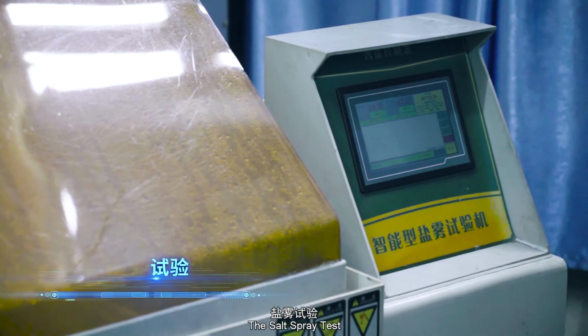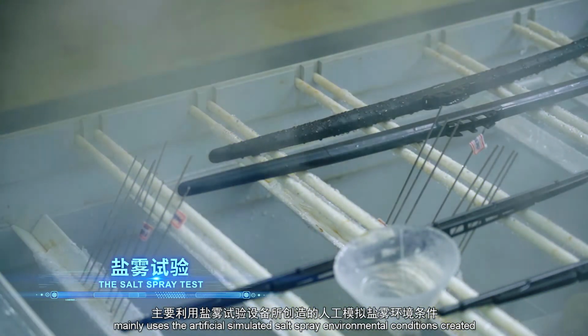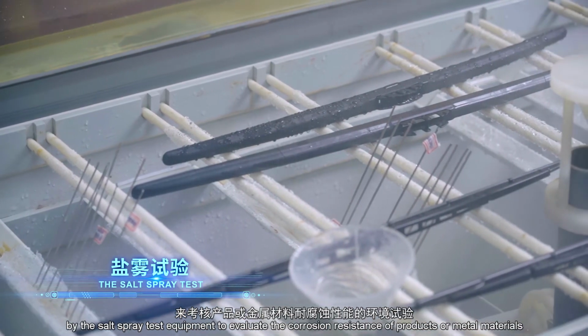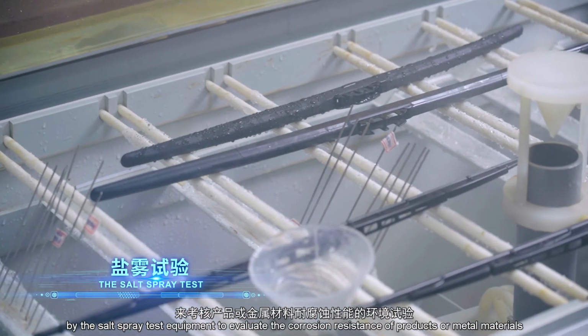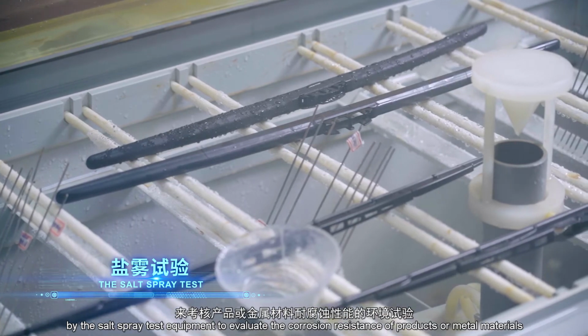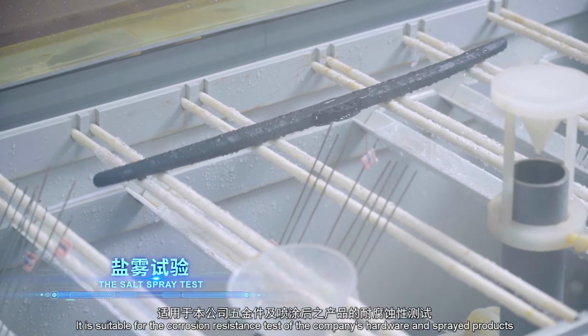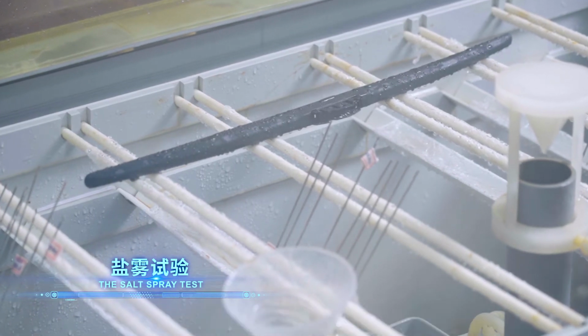The salt spray test mainly uses the artificial simulated salt spray environmental conditions created by the salt spray test equipment to evaluate the corrosion resistance of products or metal materials. It is suitable for the corrosion resistance test of the company's hardware and sprayed products.